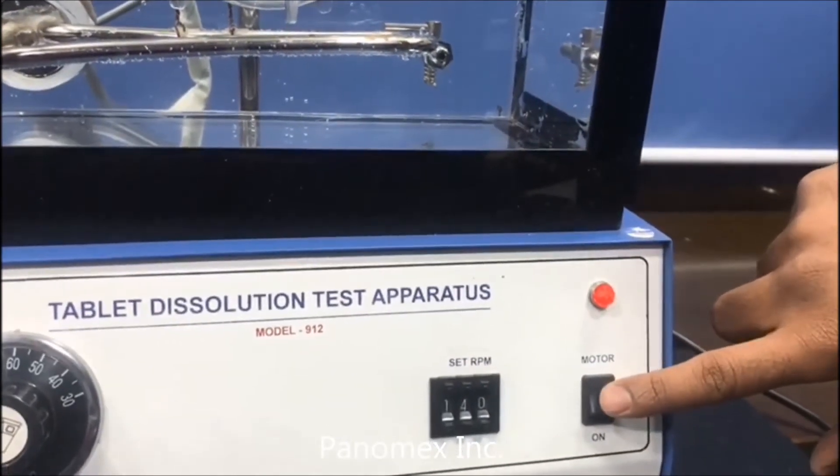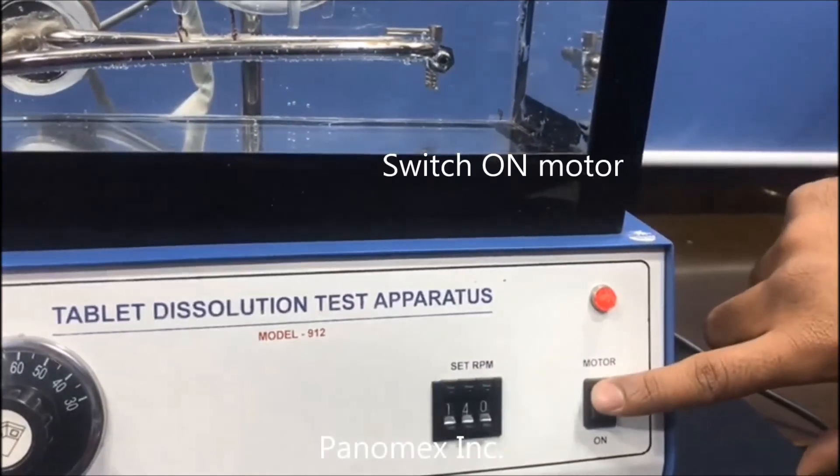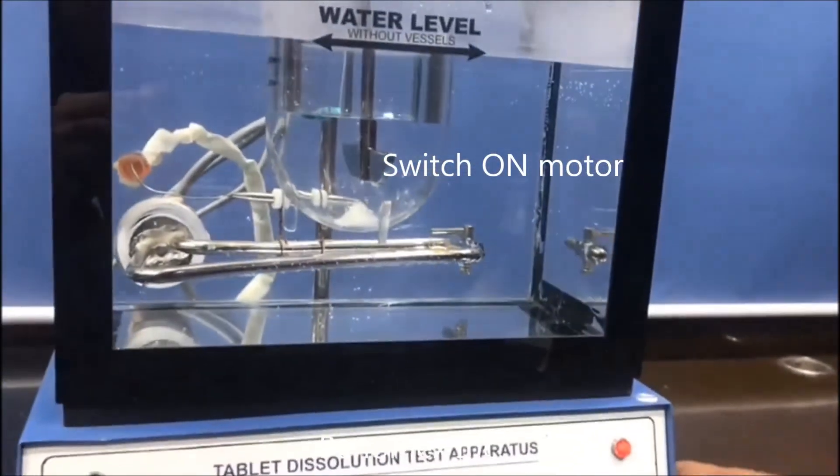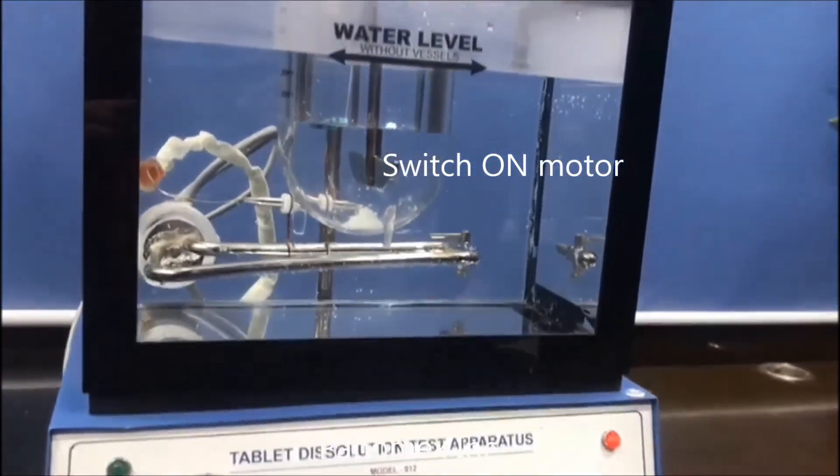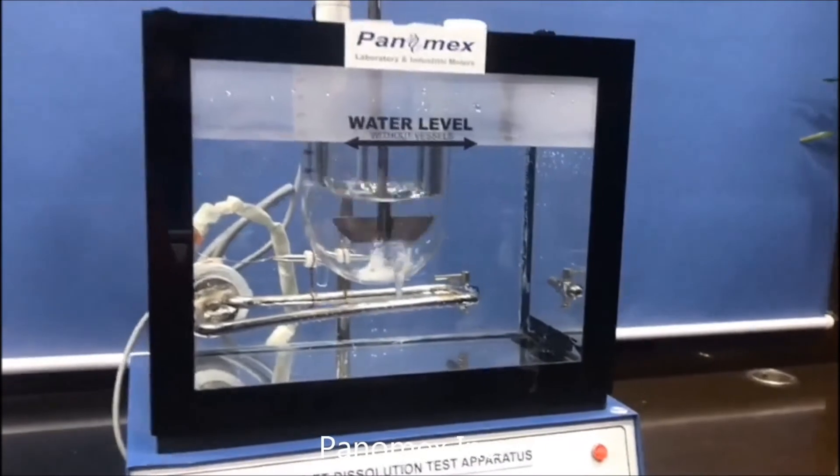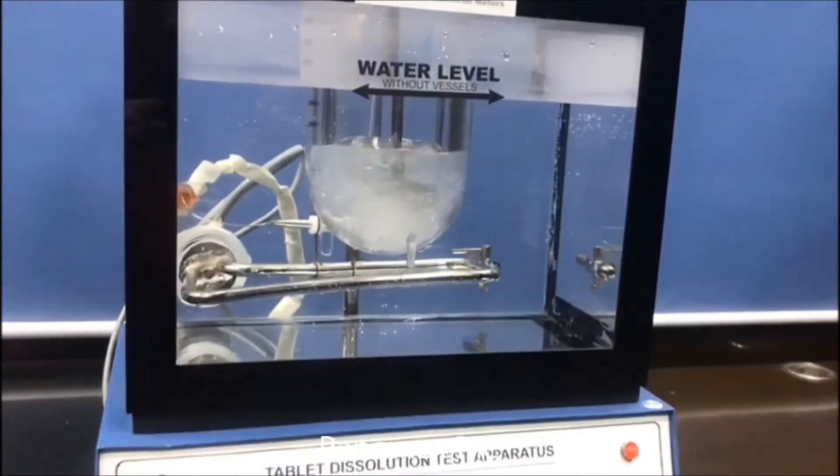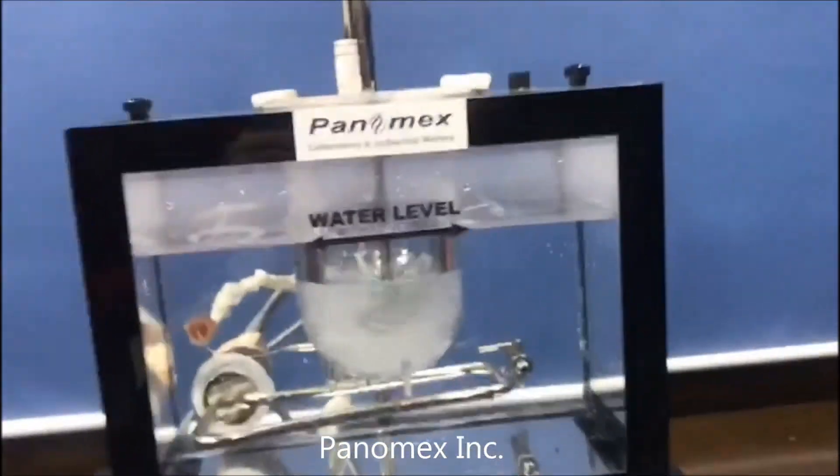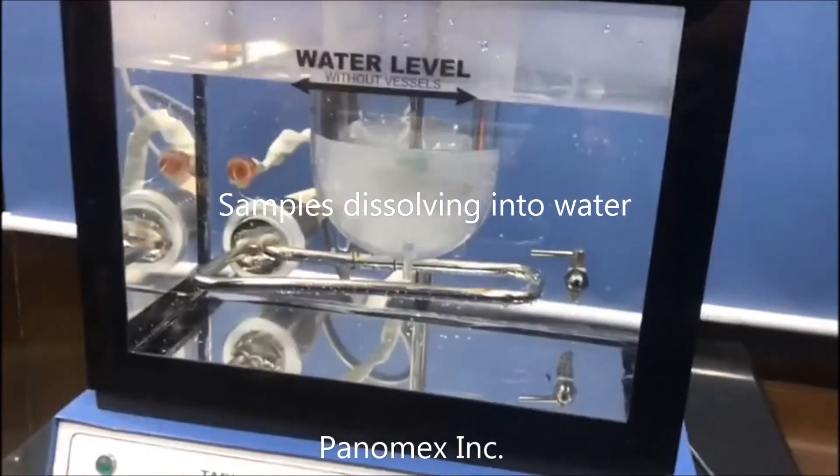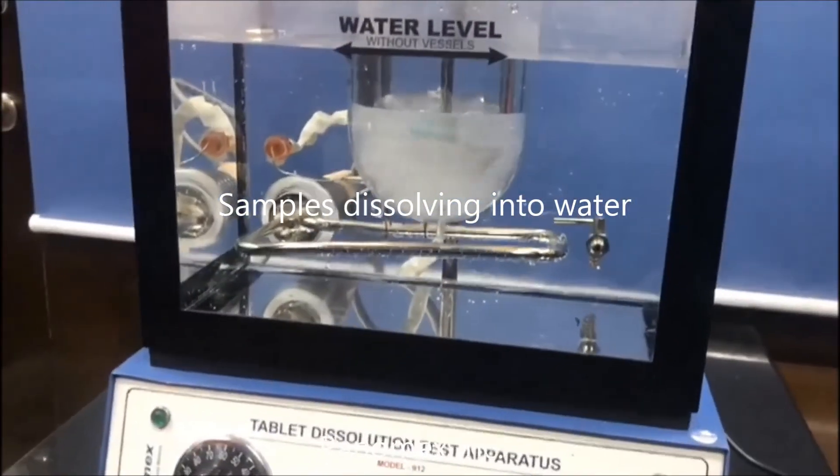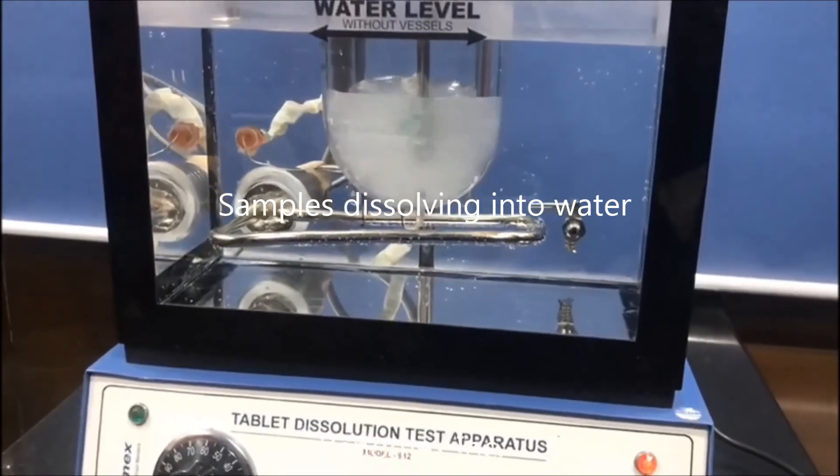And this is the motor switch through which this stirring machine will get started. This is on right now, and as you can see, the machine is now moving and we have set our desired temperature.